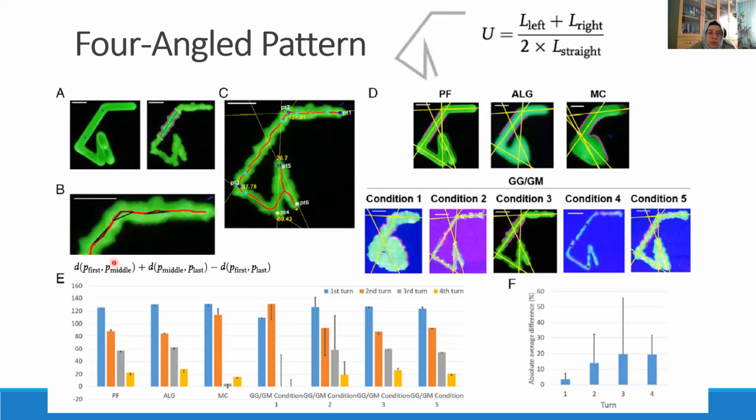Isosceles triangles created on the skeleton are shown in black, which are used to determine turn points. For each point, 3 points are determined on the line, skeleton first extracted, then 3 points. For each 3 points, we have calculated this formulation, and this triangle, which maximizes these results, is considered as a turn point.